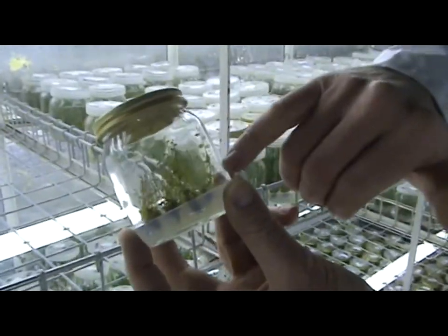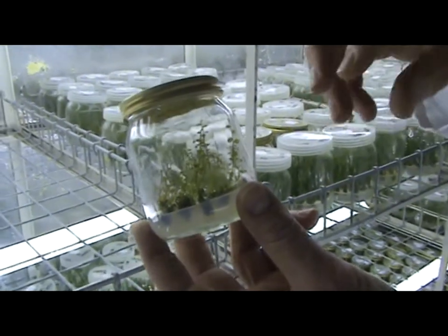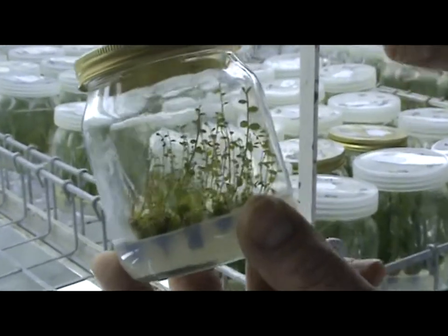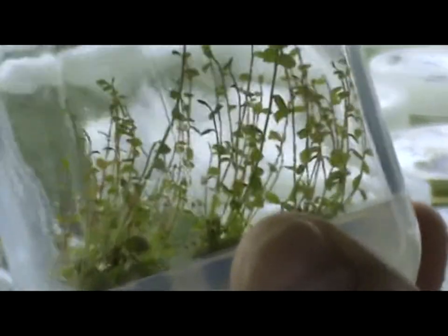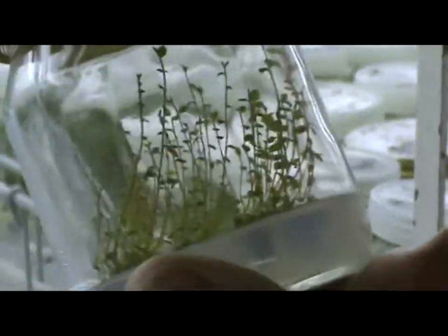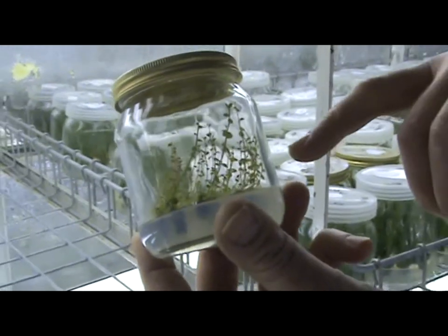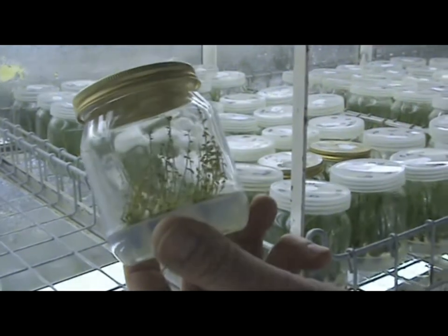The numbers increase fairly quickly, but obviously we're starting from a small piece, so initially it seems to go very slowly. But with bilberry, for example, we would get a multiplication rate of about threefold each time we culture them, which is about every 4 to 5 weeks. So every month we'll have maybe 3 times as many as we had a month ago. Once you get to about 100, then you get 300 and 900. The numbers go up very quickly, and you think we'd get knee deep in them if we're not careful. The restricting factor is how many people we've got to chop them up.